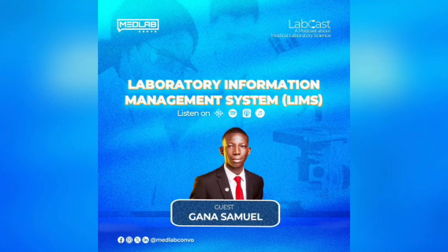Thank you for that question. When you look at the LIMS interface, there is a particular feature called bidirectional interface. What this bidirectional interface does is that it allows the LIMS to integrate with the machine in such a way that whatever you are putting into the LIMS, the machine understands. Or let me put it this way, it's like a conversation between the LIMS and the machine.